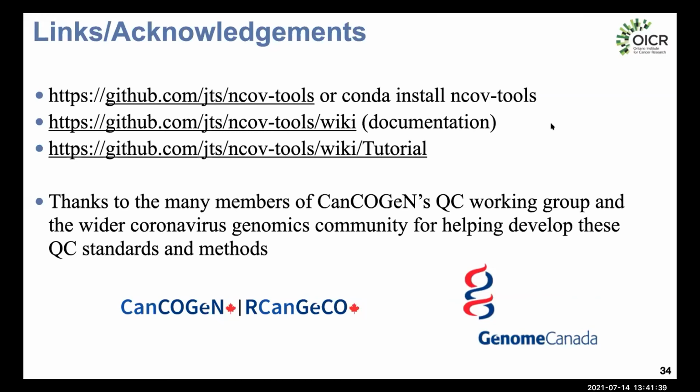Other QC that we were talking about is more difficult. You can look for ambiguous or mixed bases, but that obviously depends on the group that's submitting the data having used a pipeline that would introduce IUPAC ambiguity codes. Often the bioinformatics tools and even the sequencing protocol isn't well annotated in the metadata, so you might not have that information on how the consensus sequence was exactly generated. So it definitely can be very difficult to do the more sophisticated QC. I think this is a good chance to make the argument for uploading the raw reads somewhere.